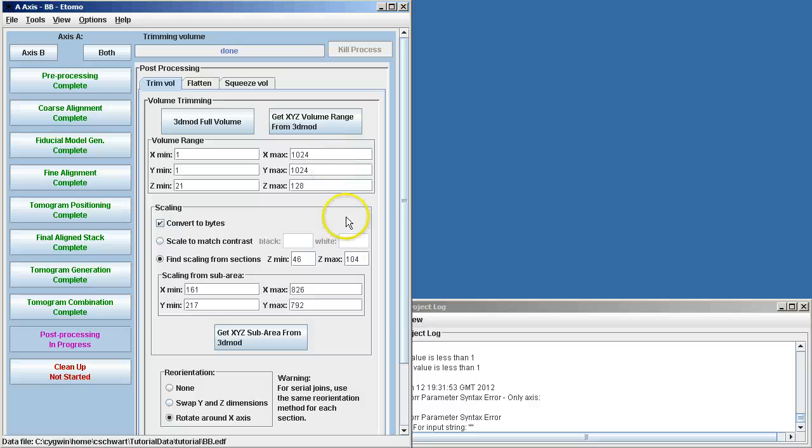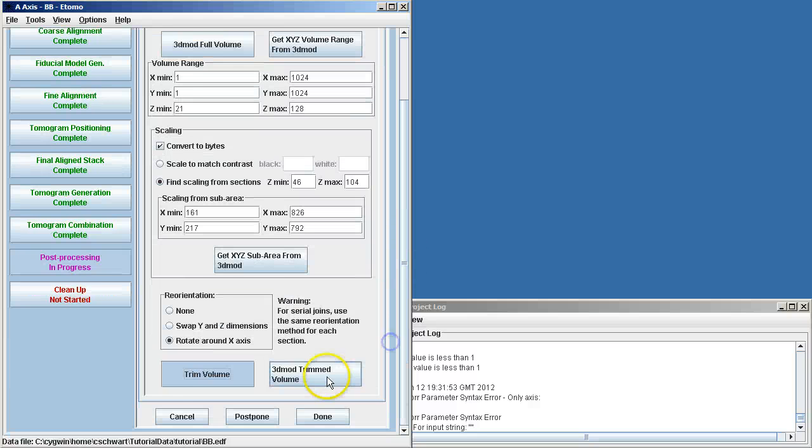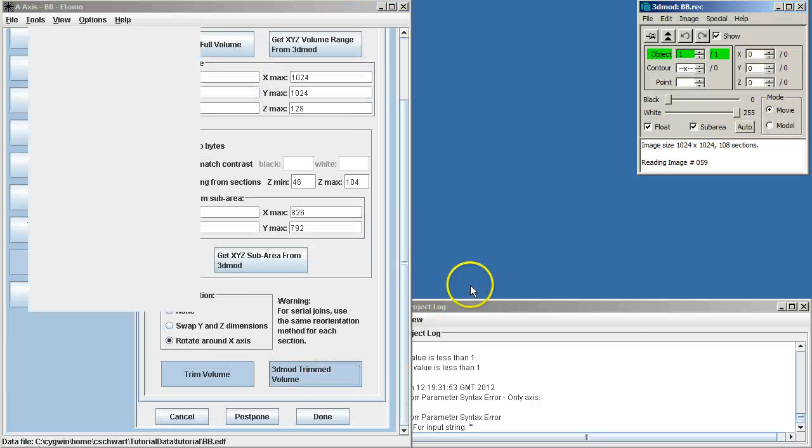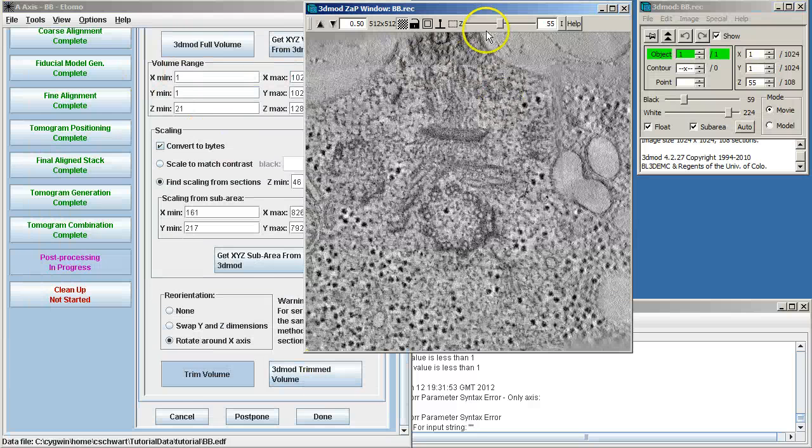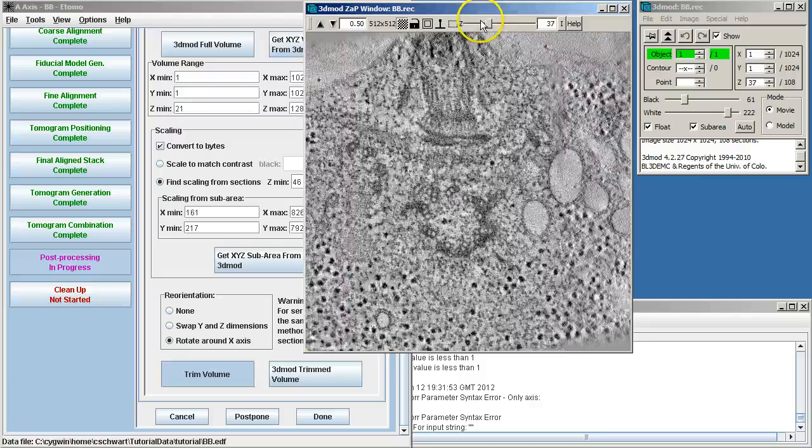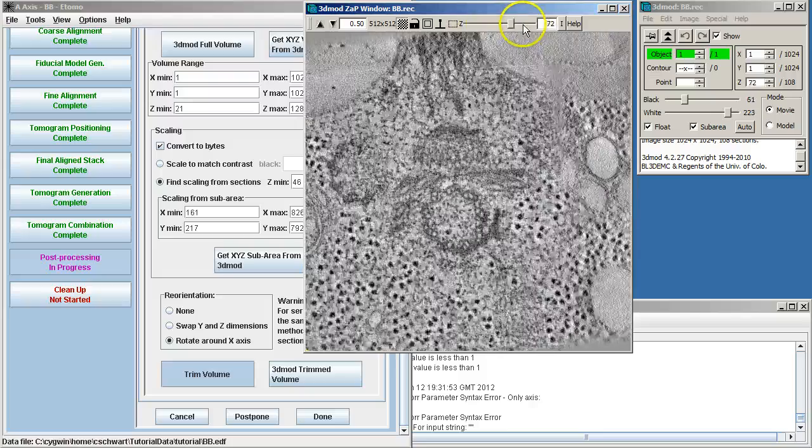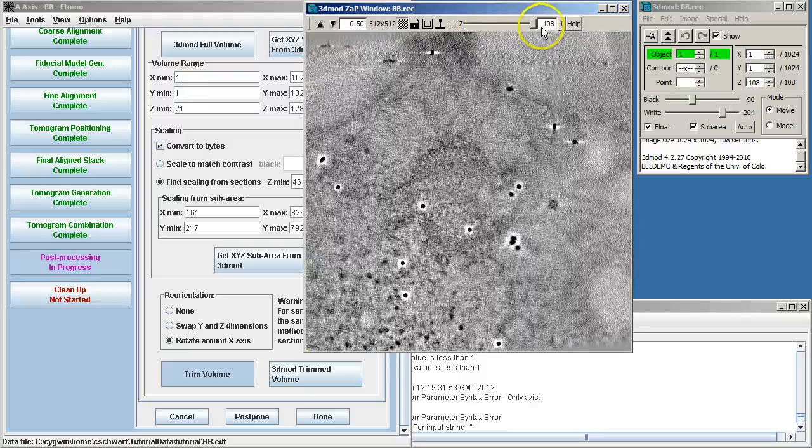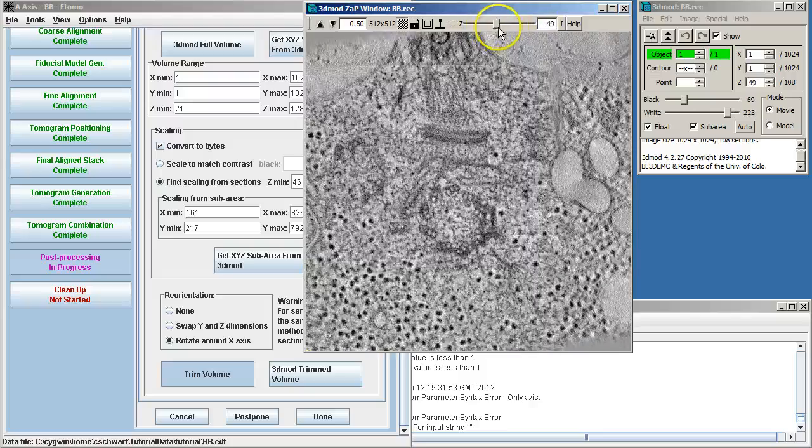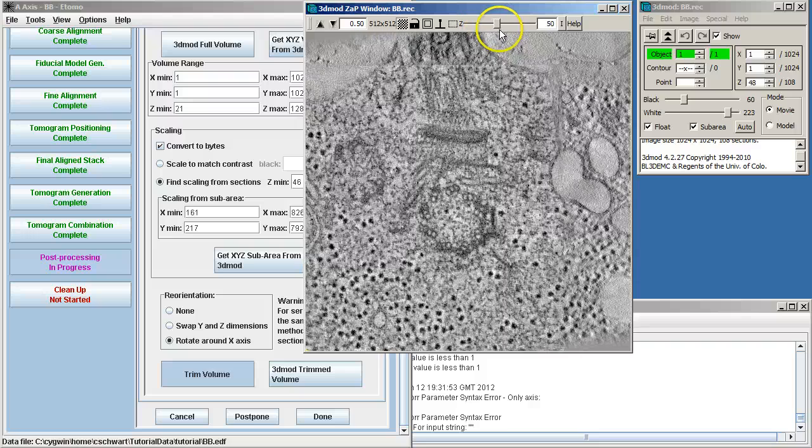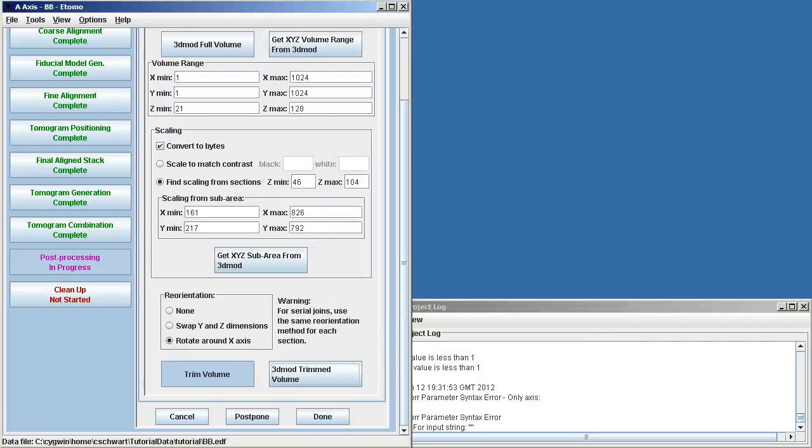So now we can trim the volume. It's already finished. Open the trimmed volume. And as we move it through, we see we have very nice contrast, and it's trimmed down the volume in the Z that we don't want.